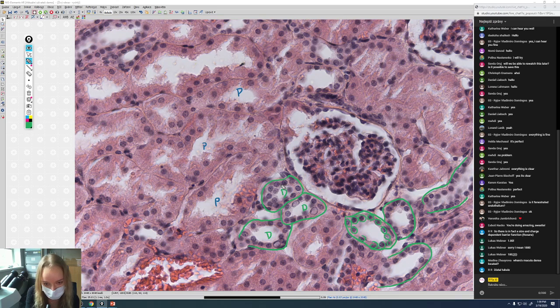They are still eosinophilic, but less, and they don't have a brush border on their surface. They also have a basal labyrinth, but no brush border, though they do contain microvilli. One microvillus here, there is another, a third one, but these microvilli on the apical surface of the cell don't create a brush border. They are just lonely microvilli there.